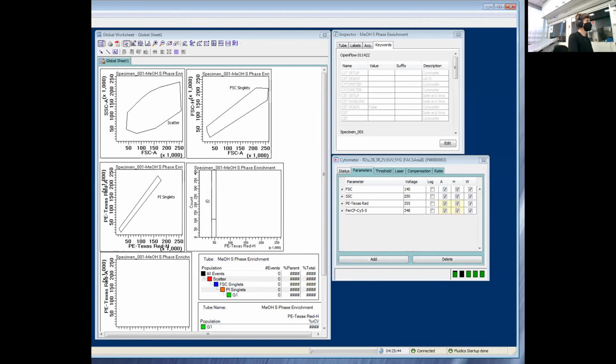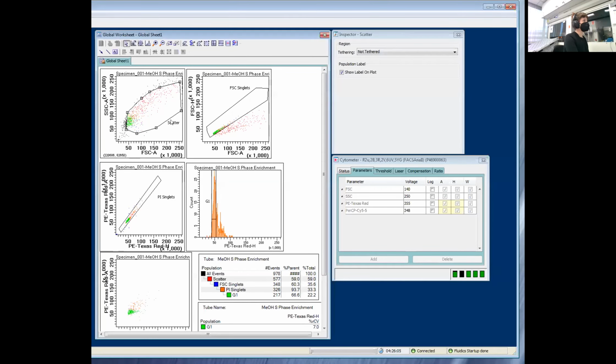Okay, and load up. Now, for this enrichment, there was a 2.5 millimolar thymidine treatment for 20 hours, and it interferes with the nucleoside metabolism and it blocks the replication of cells. So that was the treatment that he carried out for this specific treatment. And you can see with this treatment, there's very, very clearly a change in the scatter profile in these cells.